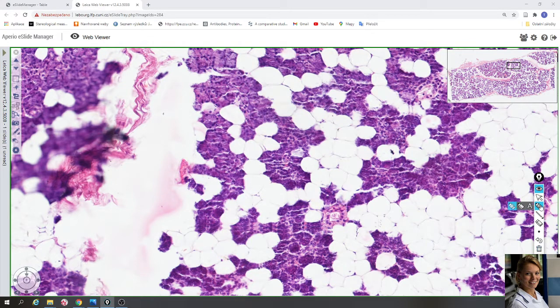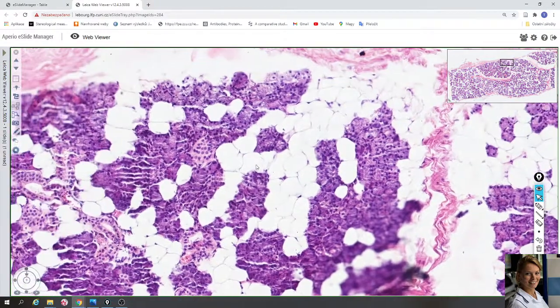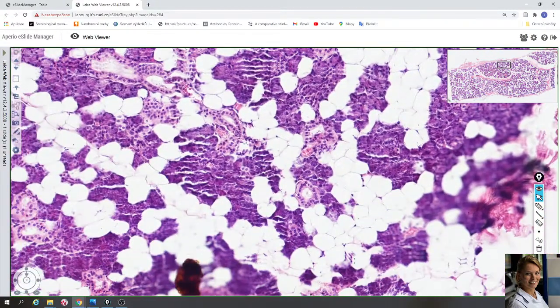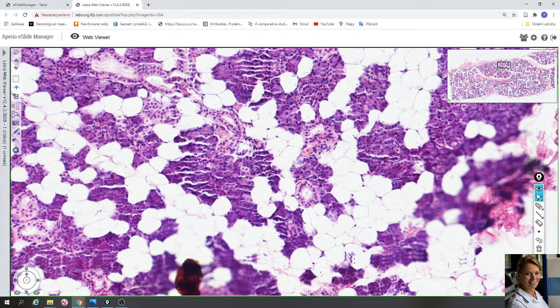Here is another striated duct. The nuclei of these cells are located in the center of the cell, not in the basal compartment. In the basal compartment are the membrane infoldings and mitochondria.